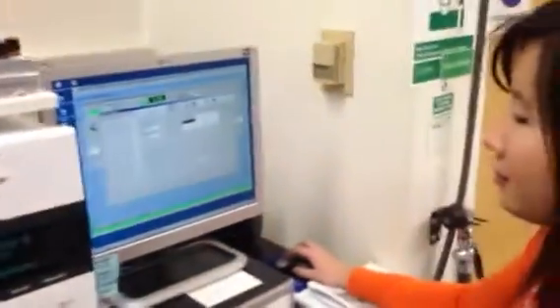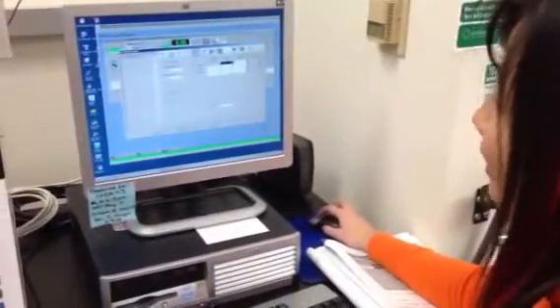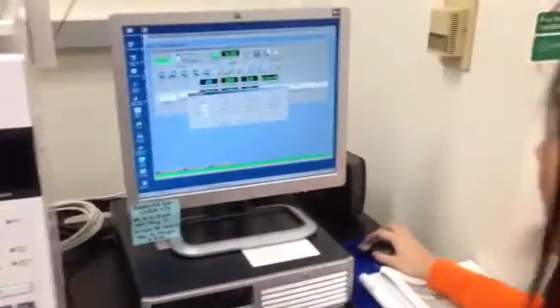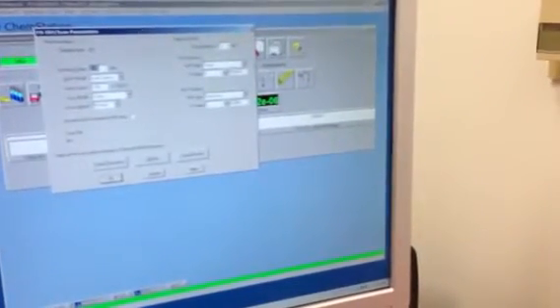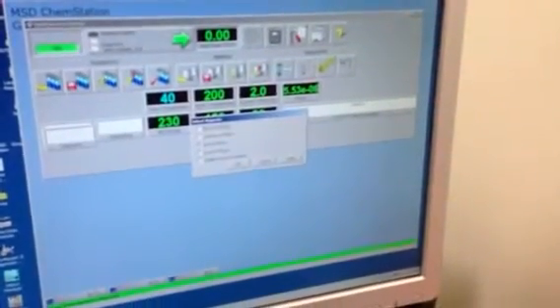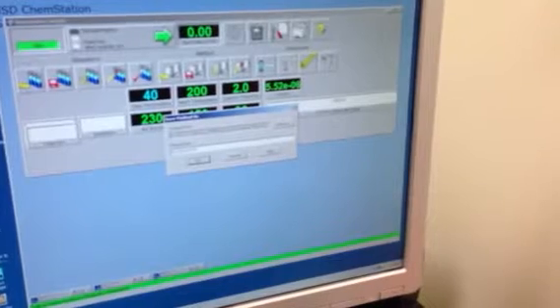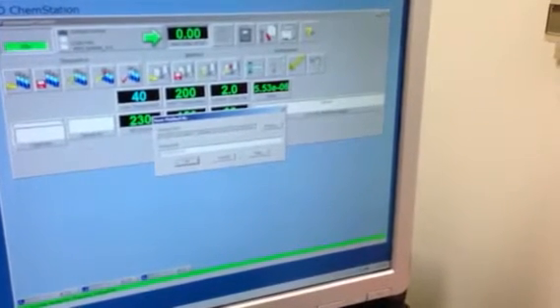Now you can see the different temperatures and how much they're going to go up at what intervals. This is the ramp, and this number is the interval at which the temperature will be ramped up. This is the minimum value and this will be the maximum value — so here's where you can change your temperature settings. Usually we just click OK through this screen as well. Here you can change the solvent delay but usually we just leave it at zero. Just make sure your method is saved in the same area under the same name, and click OK.